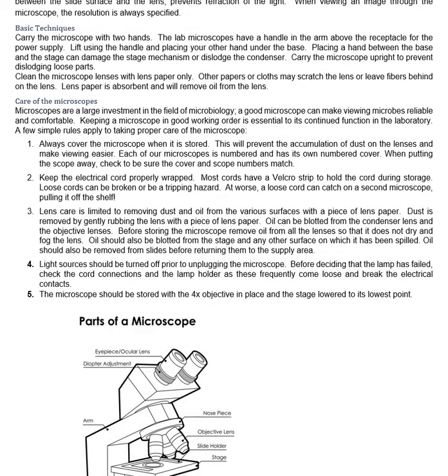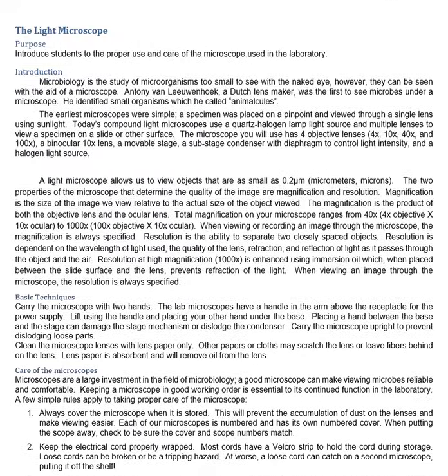Okay, guys, let's talk about Lab 1. It's going to be about the light microscope. Now, microscopes, this is really something you need to be hands on. But since we can't do that, we've got some pretty good stuff at the end of this. Let's talk about it in general.